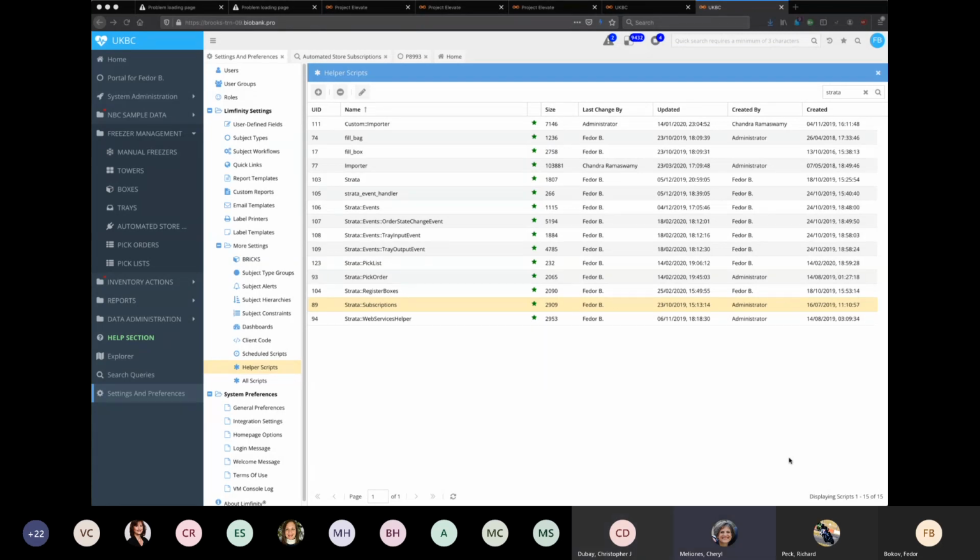Thanks. The question: you mentioned processing can be kind of slow. How long does it take if you ask for a sample to have it pop out? Is that from a Strata perspective, or do you mean from the UI request? I was just thinking in the workflow. No, I guess from a physical perspective, how long for a store to process the order?